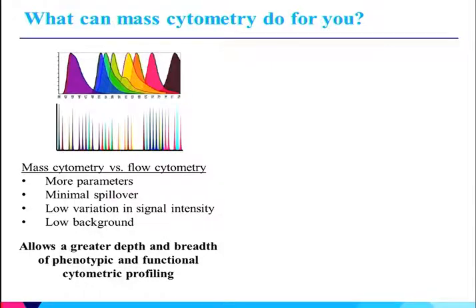So I'm gonna start off with a basic theme that's the general overview of this entire meeting, which is why do we want mass cytometry? What can this technology do for us?